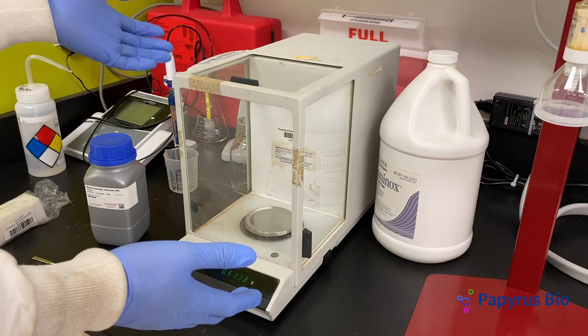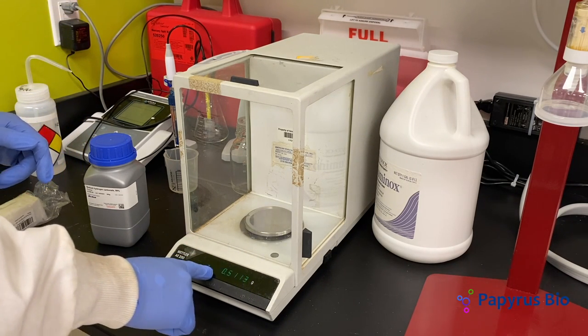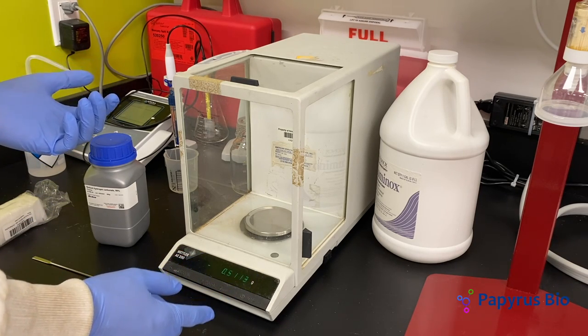This is a weighing balance, or an analytical balance. This highly sensitive lab equipment is used to accurately measure the mass of samples. It is accurate as far as milligrams. Using this instrument is simple, with a few things to keep in mind.